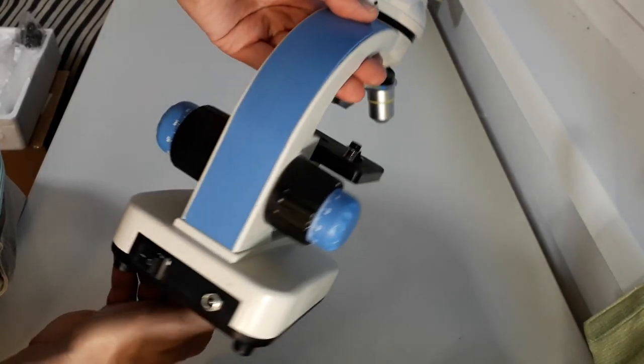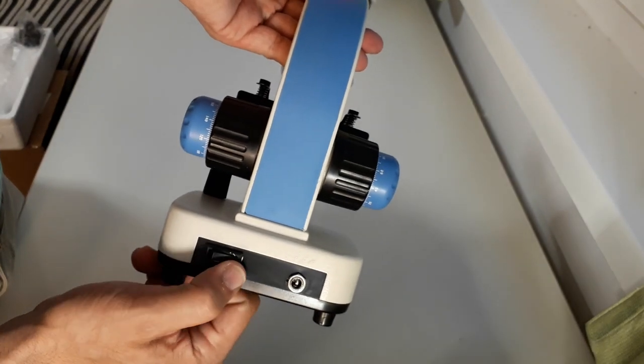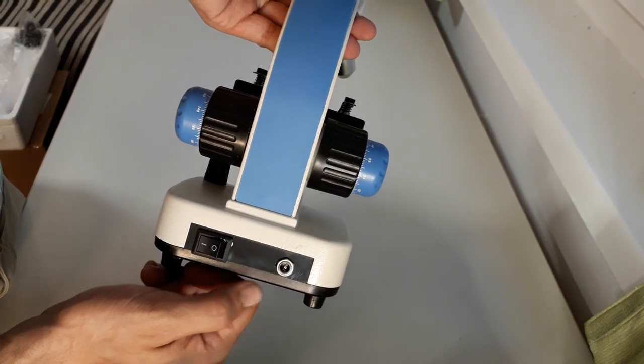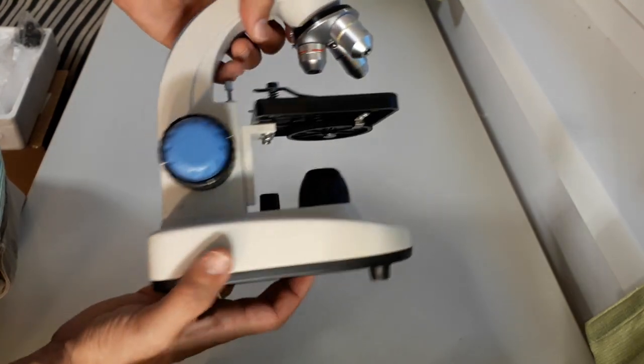Okay, it's a close-up view. Here on the back you can see there is a main switch, and next to it there is the adapter plug for the power supply.